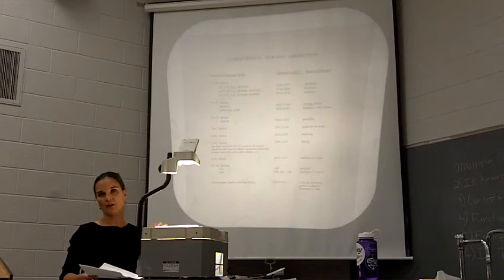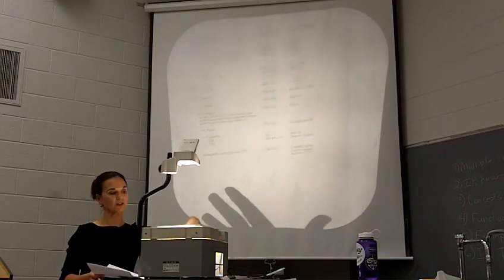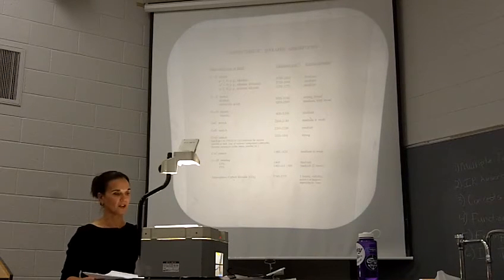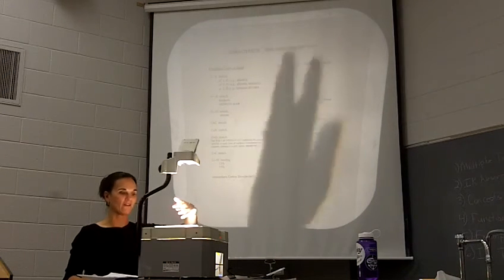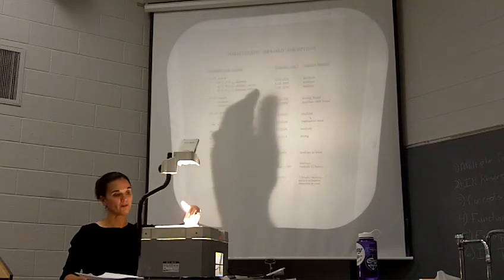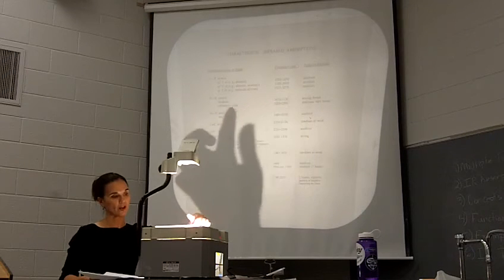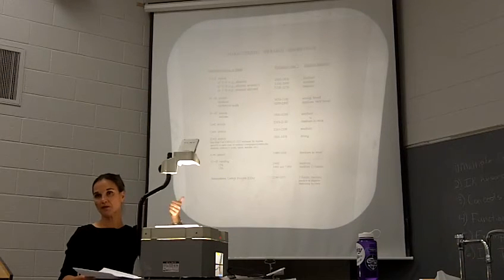To start with, as far as interpreting IR spectra, this is the sheet that you're going to use as kind of your baseline for what you're going to use to interpret the spectra and what you should be looking for in that interpretation. So if you look at the frequencies, they all fall in that 4,000 to 1,350 range, okay? And so you do want to become familiar with, okay, what is the range for CH stretching and OH stretch, all these different functional groups, primarily the ones that are important to this experiment.